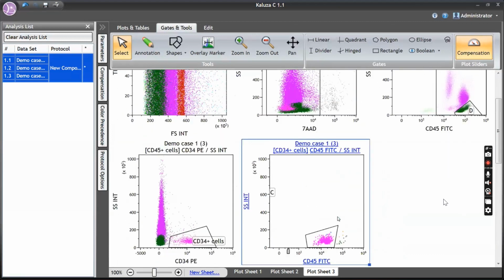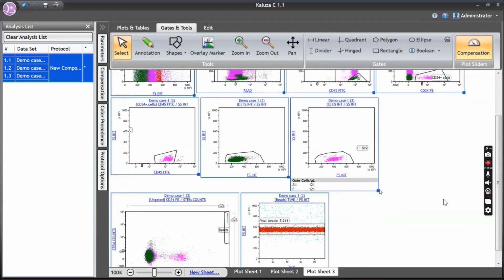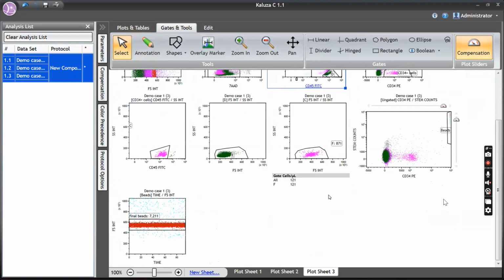So what happens is that if the lab doesn't have a good pathologist or people who are not very good at flow cytometry, they will sell the machine, and they create something called a protocol. What I have done one by one together is called a protocol. So they make this protocol and they will lock it. Lock it means that you cannot adjust it. And whenever you get a stem cell CD34 sample, your technician who doesn't know anything just drags the protocol, acquires in that particular protocol, and finally the value will come here and he will give that off.